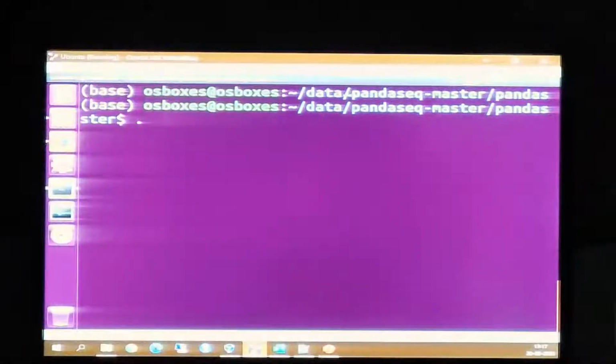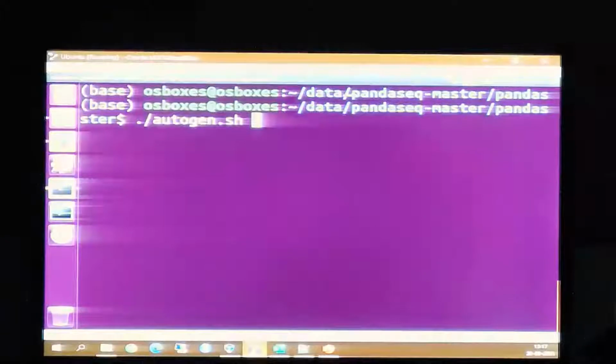First we will give ./autogen.sh. Just type ./AUT, press tab and everything will come, in that folder only. After that, there is dot configure. We'll give everything one by one; you don't need to copy everything. Once you have written this, press enter.